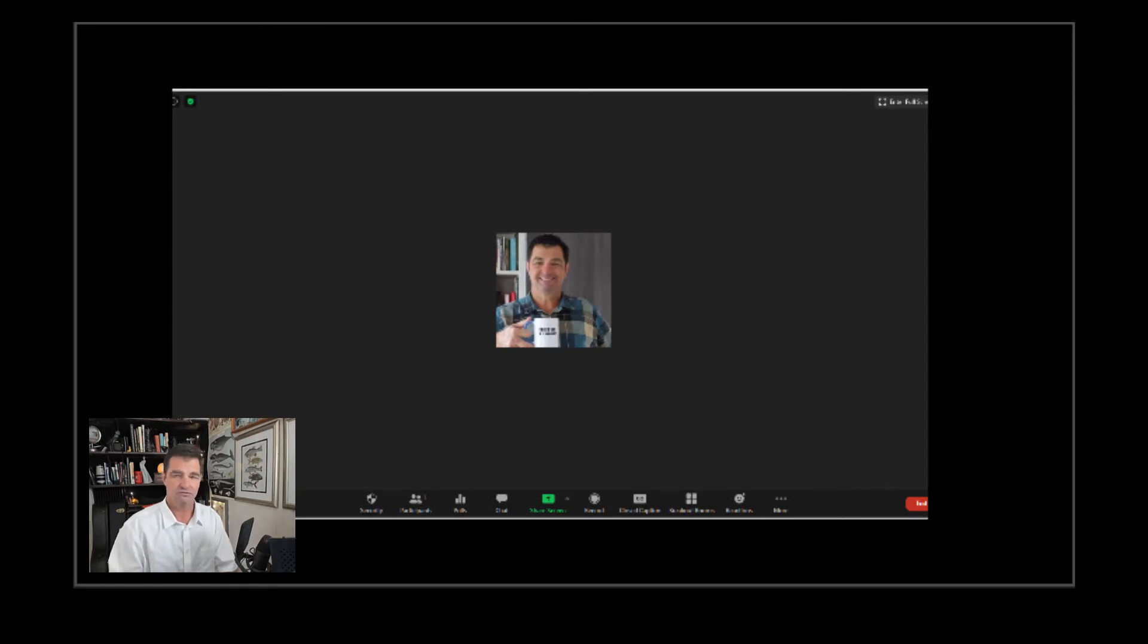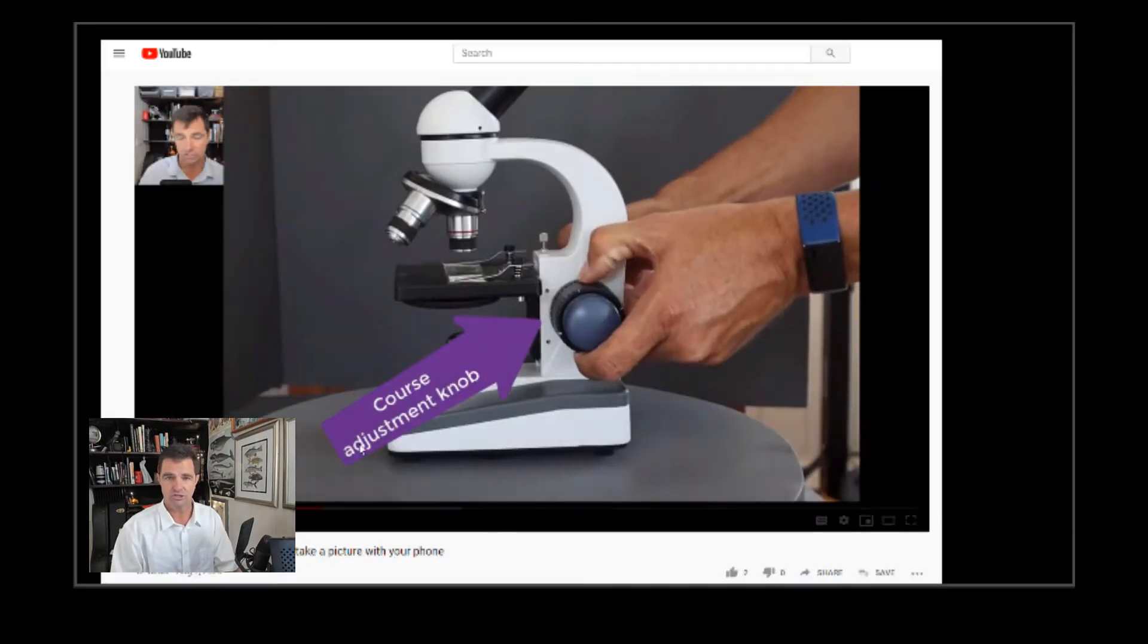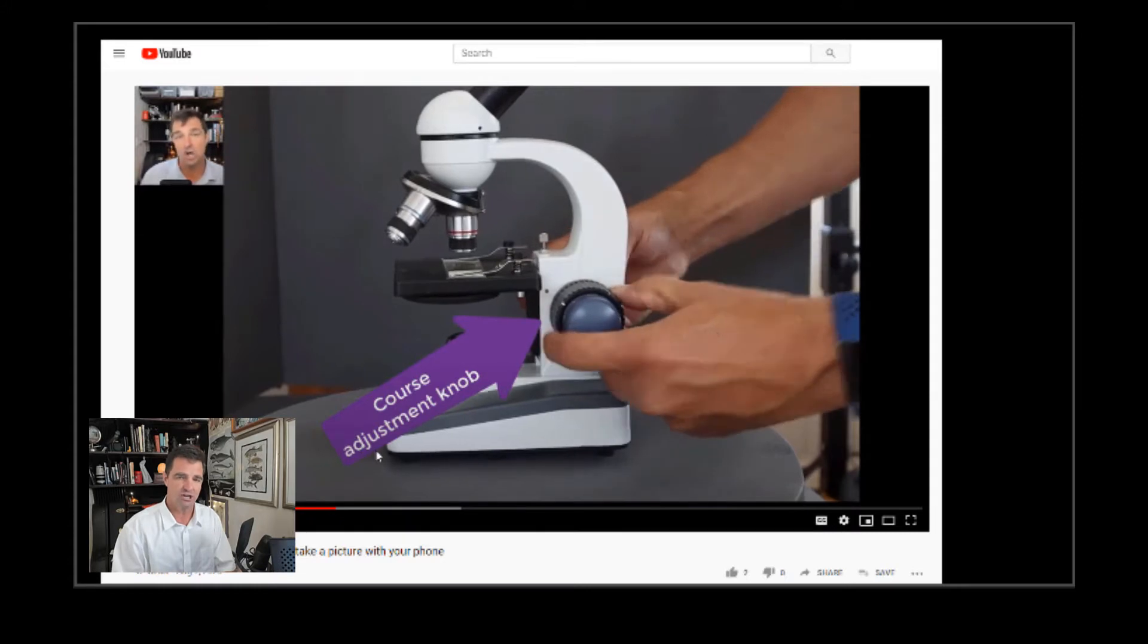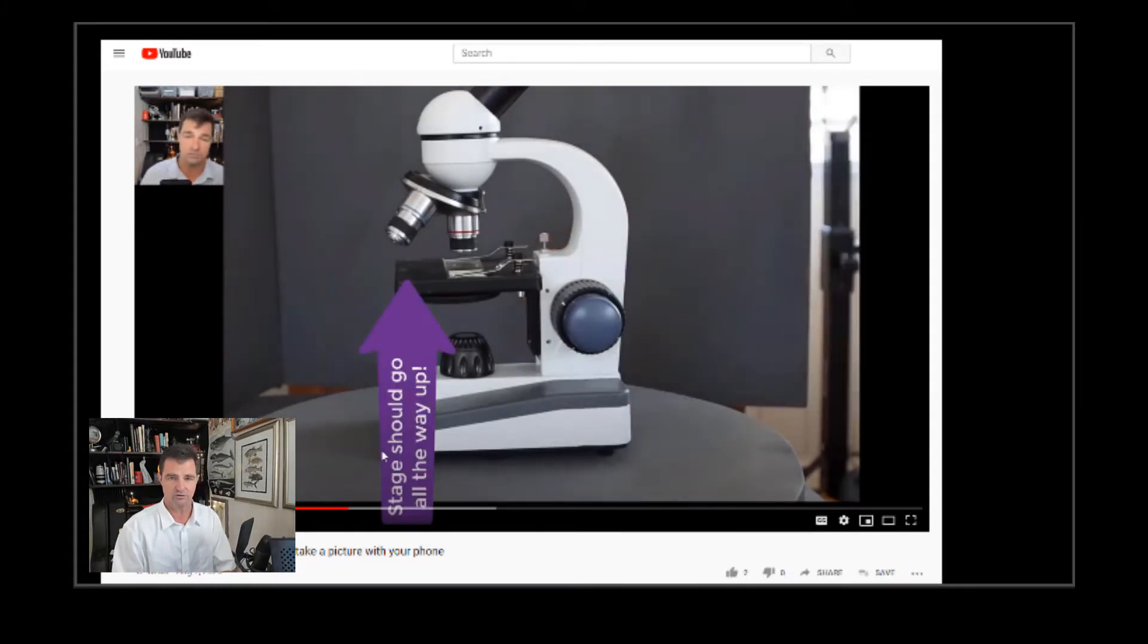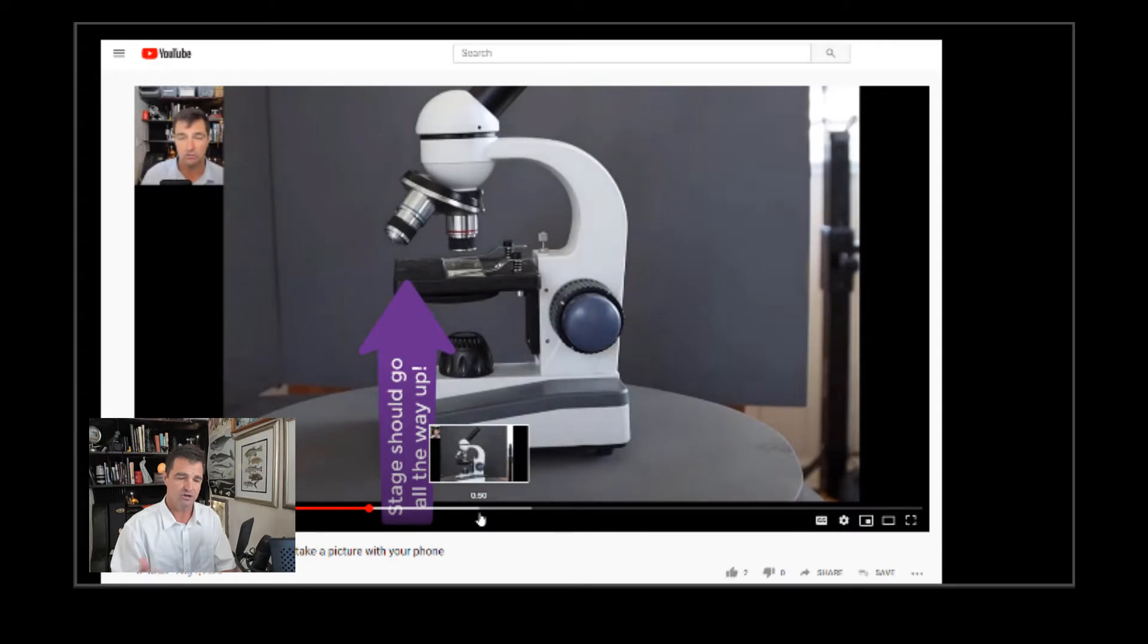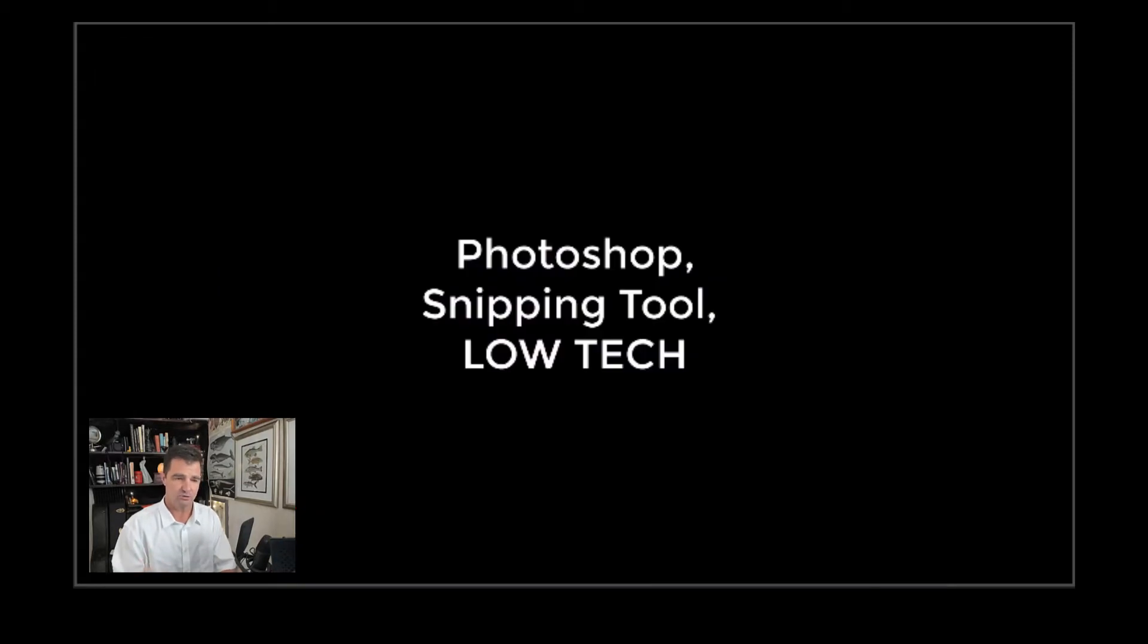Now the first thing you're going to want to do is watch this video where I explain how to focus the microscope. If you haven't done that, we're going to take a picture through your microscope of your slide.